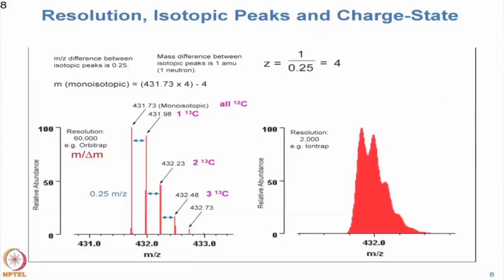All right, so once you get some data out of a mass spectrometer, these are some of the basic characteristics of it. I told you that there were isotopes, okay? So instead of getting a single peak, we get multiple. This first one, the leftmost or lowest mass peak, is referred to as the monoisotopic peak. That means it was measured from a molecule that contained entirely the first isotope of the elements it contributed to, okay? Because carbon is the most abundant element, the major contributor to the other isotope peaks is carbon-13.